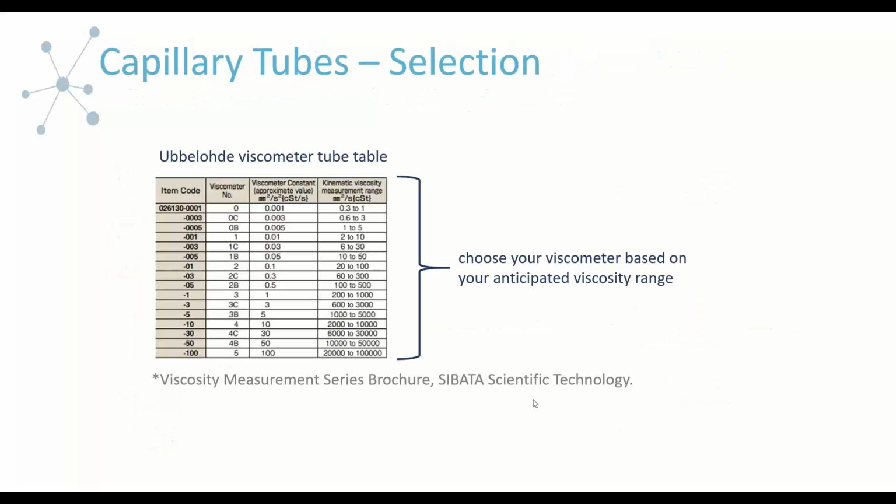So what will happen when you go to select your capillary tube is, and I sort of borrowed this table from a brochure that is advertising some of these tubes, rheology tubes.